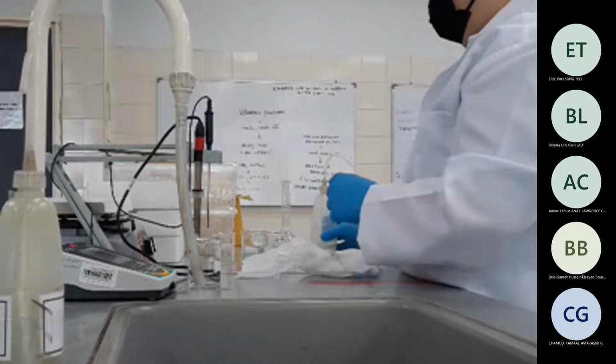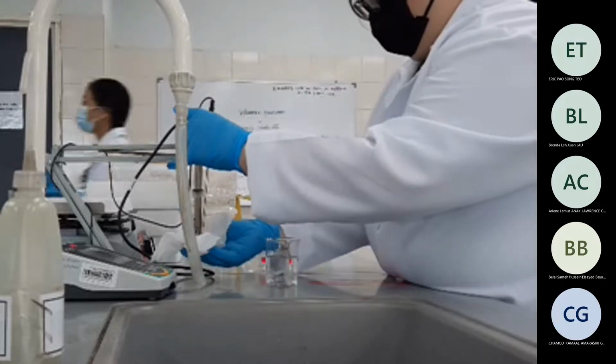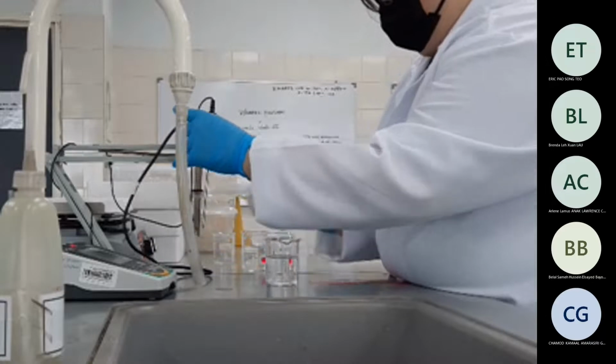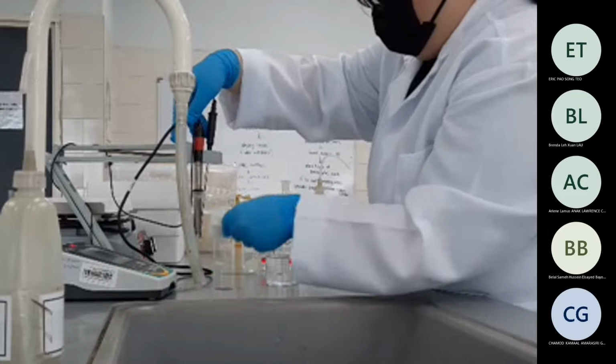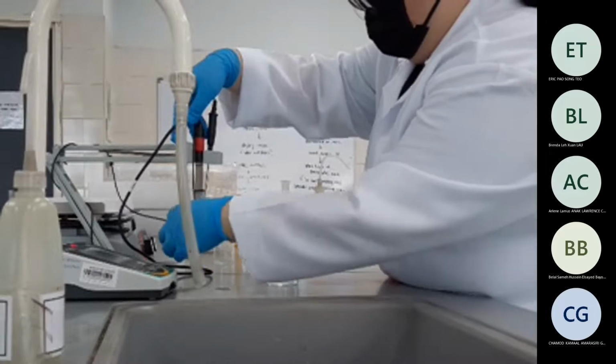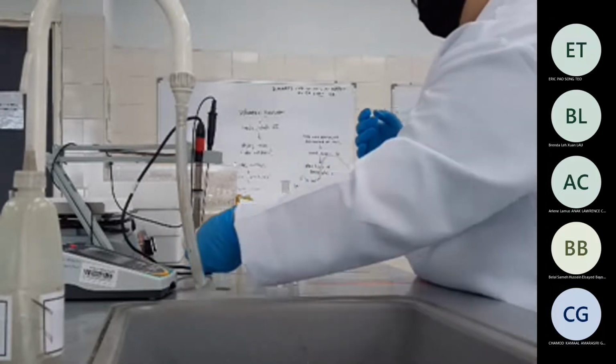Done? All right, so take 4 beakers and take 25 milliliter of tap water. Not tap water, I think deionized water, right? 25 milliliter each. So distilled water. Yeah. We don't have deionized water, so we'll be using distilled water.